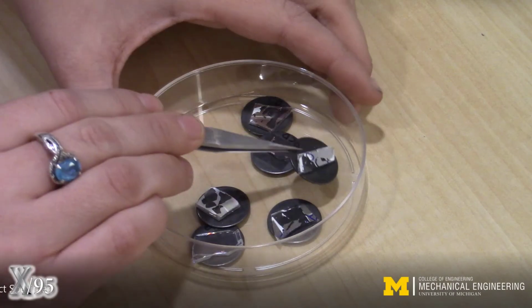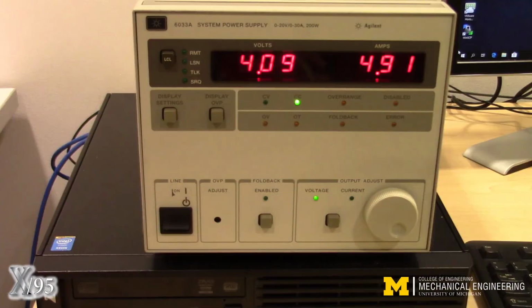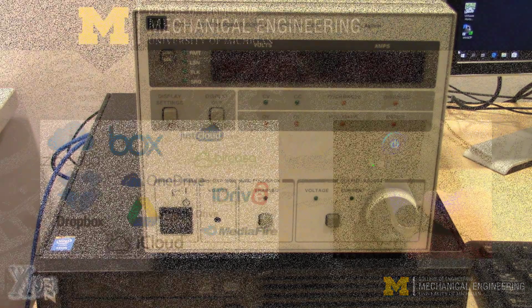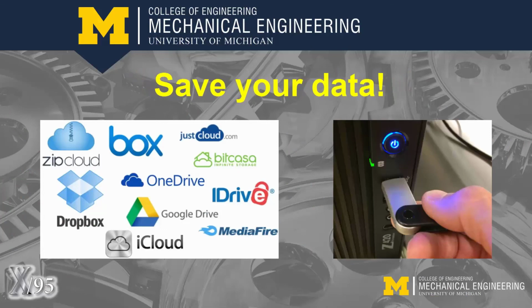When finished, use tweezers to return the specimen to the proper container, and then shut the power supply off. Remember to save your data and images before leaving the lab today.